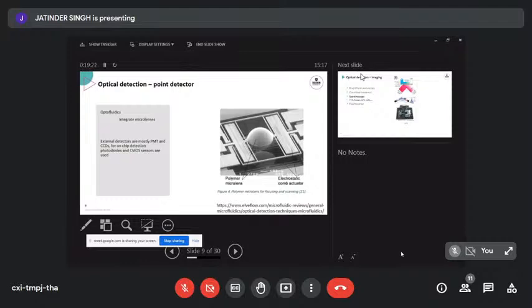Even if you've got just a slightly curved lens sitting next to the channel, that may actually already allow you to focus your light in much smaller dots. And there's some really nice simulation packages in optics that help you determine what the curvature is of the integrated lenses that you want to have. But here you can see a nice round polymer micro lens that has been integrated into a microfluidic device that also contains some electrodes.